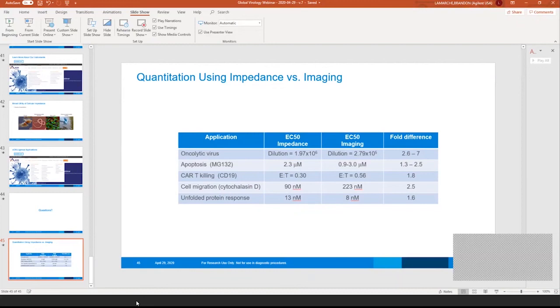If you talk about just the change in the composition of the medium, something like increasing the ionic strength, for example, you could see a change in impedance. But what's important is that you use the appropriate control. So if you're using a drug that's in DMSO, you add the DMSO vehicle by itself, and you're going to see a small change. It's important that you compare everything else to that control.